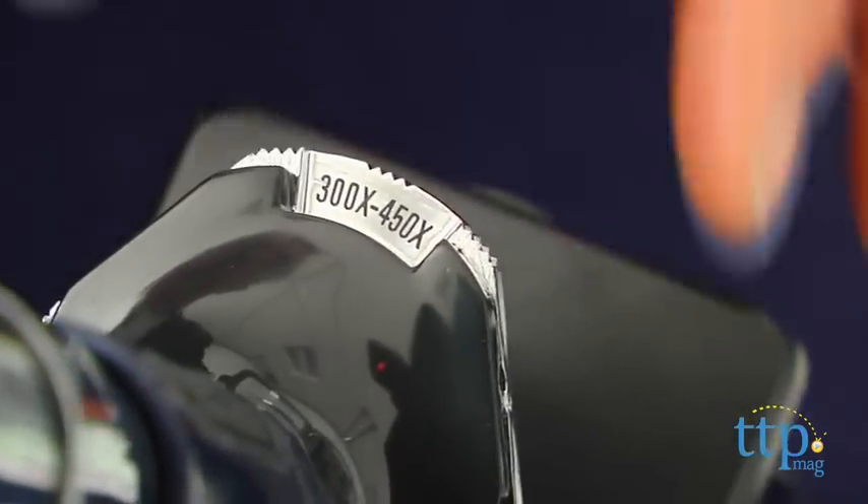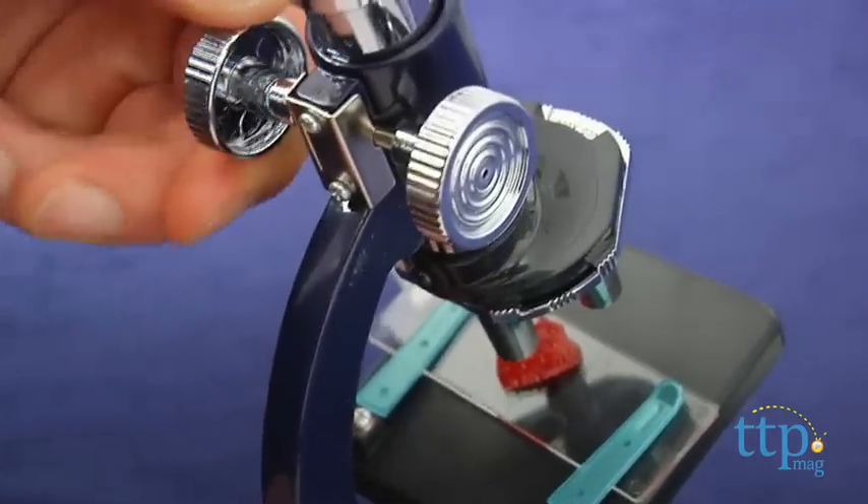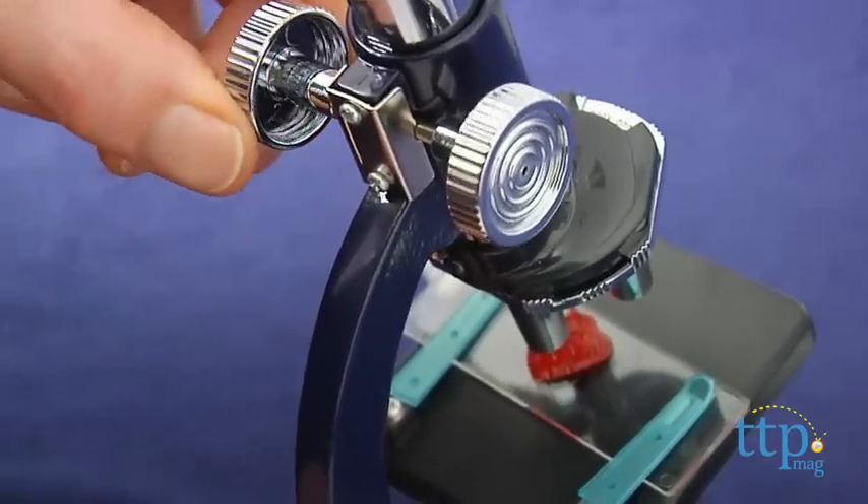The resolution is sharp, and while this is not a professional or even academic microscope, kids can still do a lot with it. For the science-minded and the curious, this is everything they need to get started.